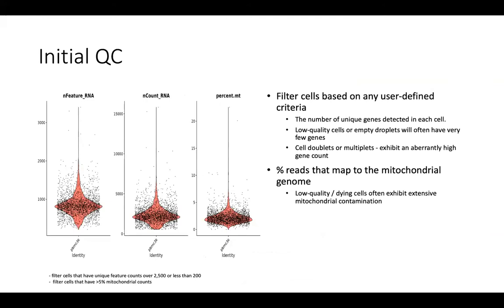As Derek was mentioning, 10x data is inherently challenging because there could be cases where you have multiplets, you have doublets, which is probably the most frequent in gene expression data. And because cell viability is a critical factor in maintaining the robustness of the underlying gene expression data, we need to be able to clean out cells that are not viable or are dying.